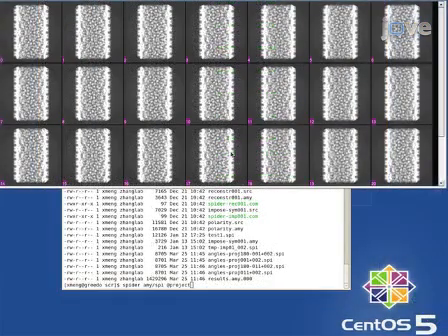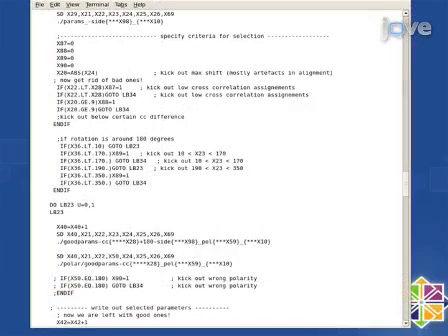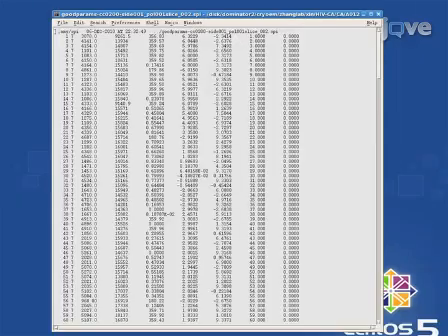The variation in the out-of-plane tilt angle is limited to plus or minus 10 degrees and sampled in 1 degree steps. Introduce constraints such as high correlation coefficients, in-plane angles near 0 degrees or 180 degrees, and limited X shifts for the alignment parameters of each segment. Include in the reconstruction only those segments that satisfy the constraints.